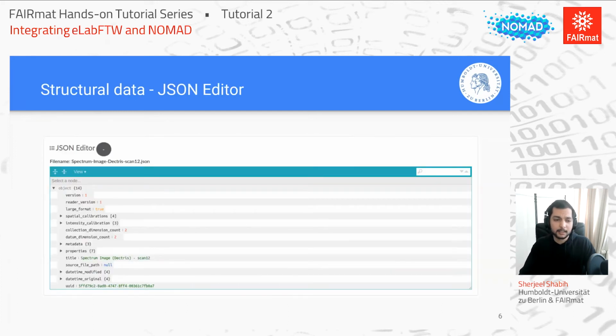On top of that, this is an example of the metadata that we capture from one of our sensors from Dectris. And this is not really easy to place in the rich text, because if someone by mistake erases this last S here or misspells calibrations somehow, any automated system that runs over it would fail. While in a JSON format, you really can edit the fields on the side. And this has led to actually the HTML web elements you saw when Pepe was demonstrating in the last talk, where you can have your sample ID, owner, and dropdowns and whatnot. This also comes from this kind of structure.